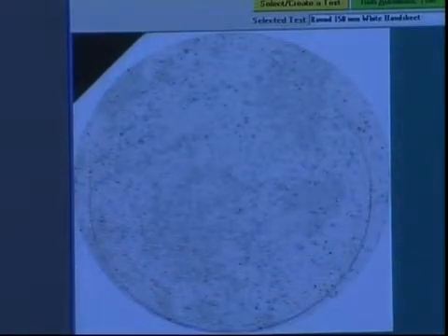So we don't want to measure the handwriting, so we'll set up an area of interest that does not include the handwriting, and we'll finally adjust this. We'll get it below the handwriting.